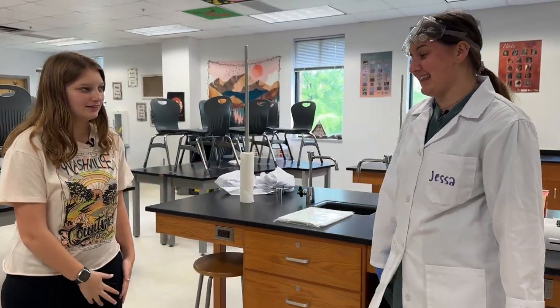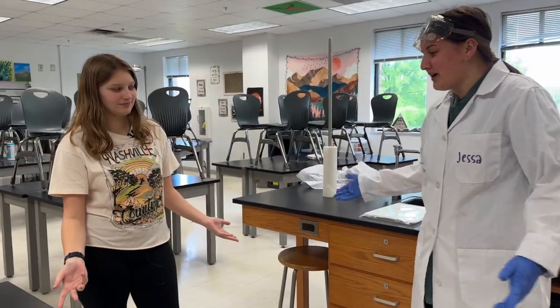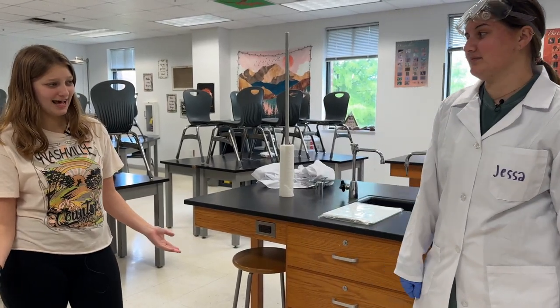You can't come into the lab looking like that. Why not? You're not wearing the right PPE. PPE? What's that? It's personal protective equipment, like this.